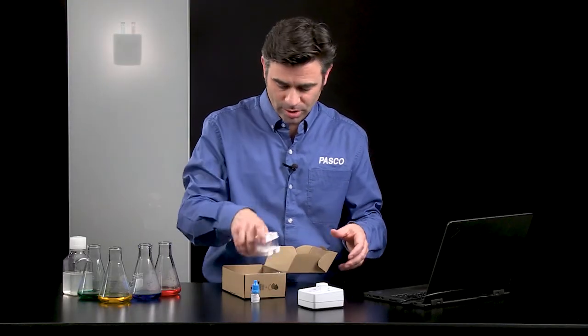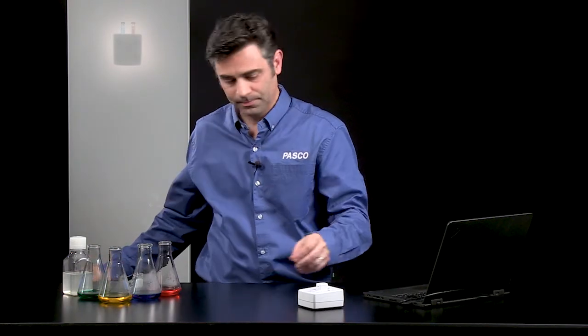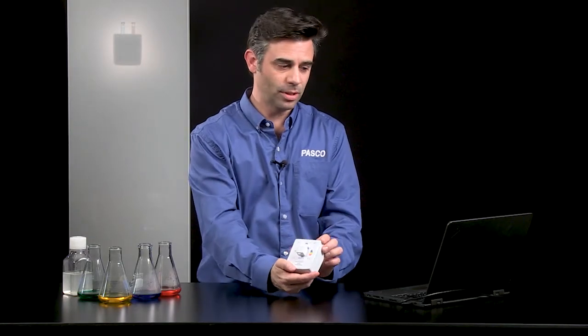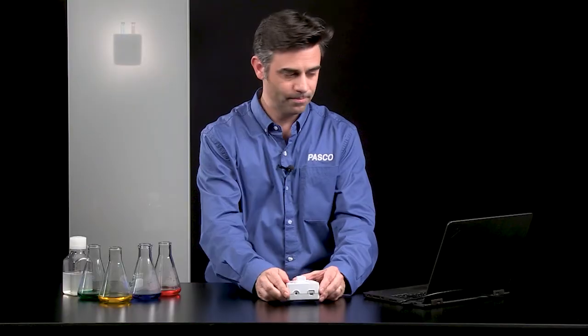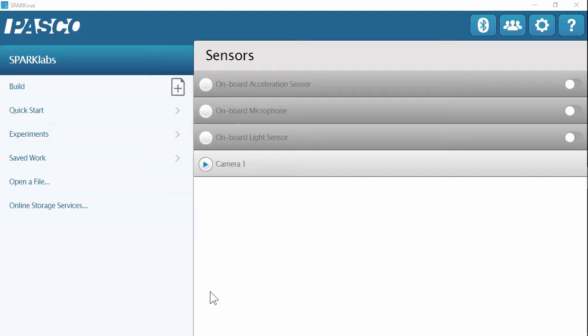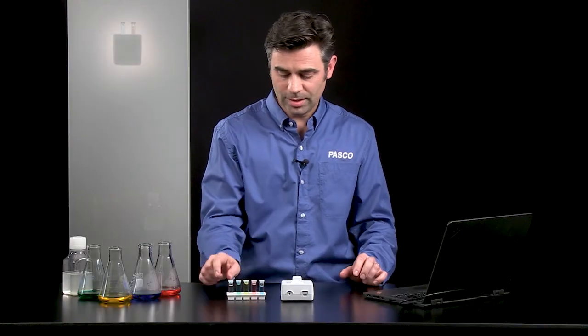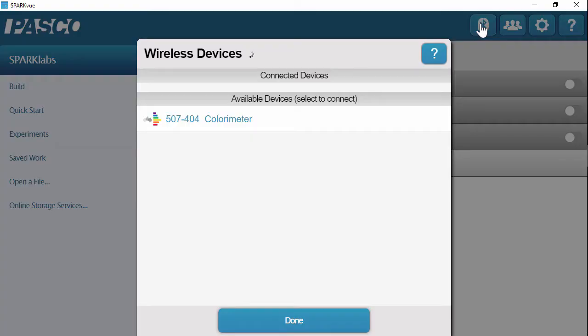So first, we are going to focus on the colorimeter. To do that, I'm going to connect it to my software, and I'm using SparkView software. So I'm going to turn on the colorimeter sensor and connect it via Bluetooth. And using the colorimeter, I'm going to test these prepared cuvettes. So my device pops up. I'm going to connect to it.